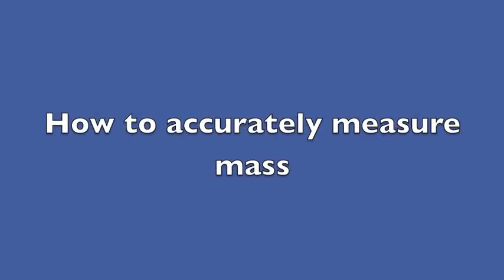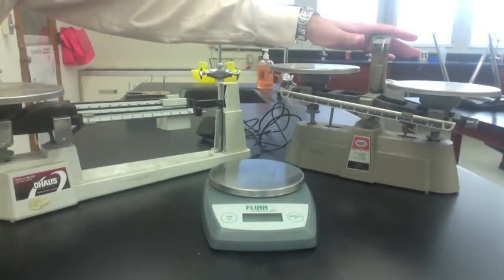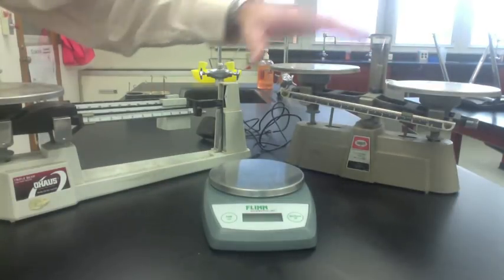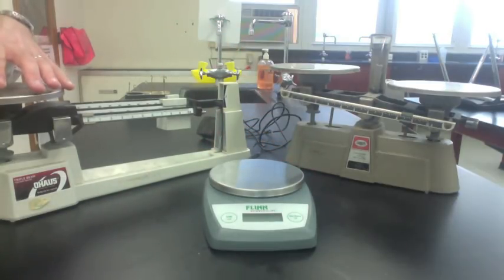There are several steps you need to do to accurately measure mass. First, use the right scale. We can use an equal arm balance, like this one, a digital balance, like this one, or a triple beam balance, like this one.